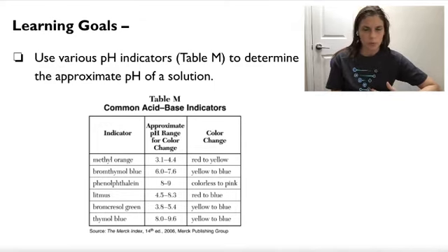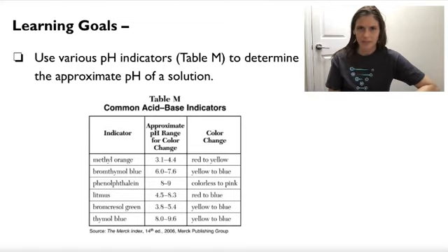Now, I'm going to be performing a lot of the work on the lab bench for you all. You're going to be watching as I go through and use some pH indicator with various substances. So I just wanted to talk a moment about the safety precautions I will be taking as I do this lab. During the lab, I am wearing a lab apron to protect my skin and my clothing. I'm wearing goggles to protect my eyes. My hair is pulled back in a ponytail to make sure that none of my hair can get into any of the solutions that I'm using.